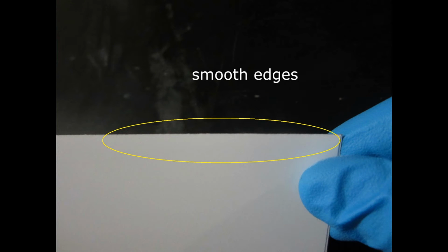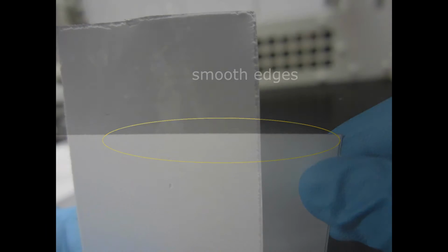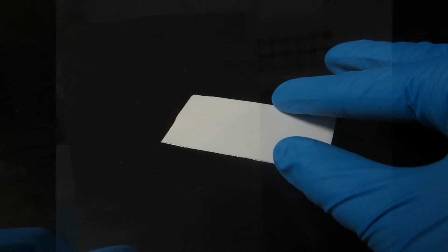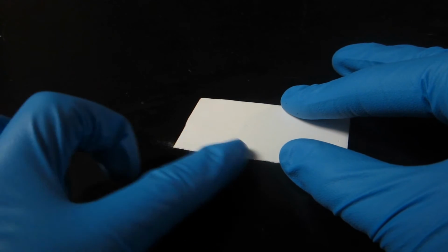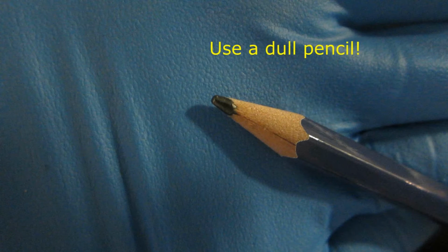Before you begin, select a TLC plate that has little or no cracked edges. If your plate has slightly cracked edges, simply rub the edge of the silica plate very gently with clean gloves to smooth it out. This will ensure that your sample spots travel up the plate in a uniform and straight path. Next, acquire a slightly dull pencil to use while marking your TLC plate.